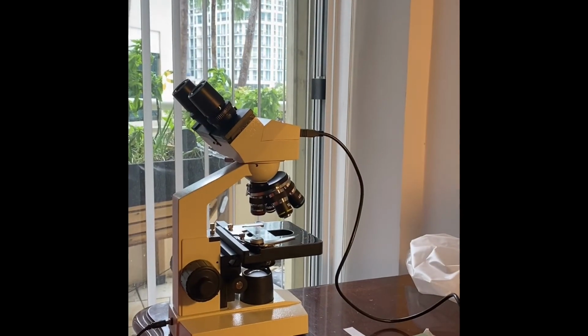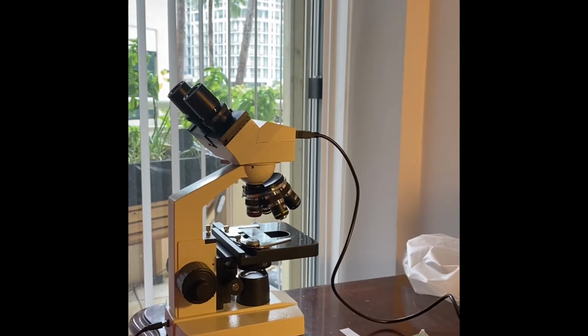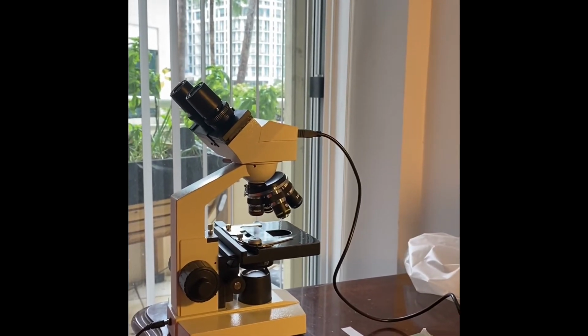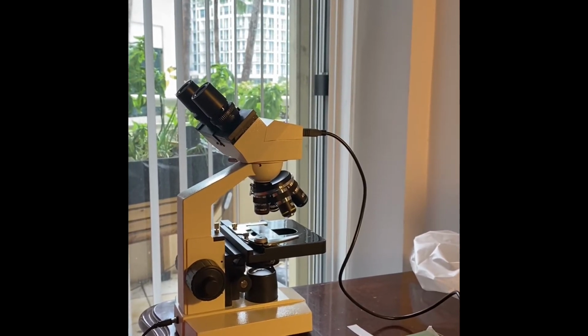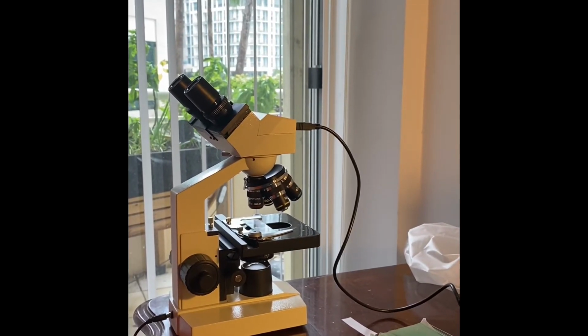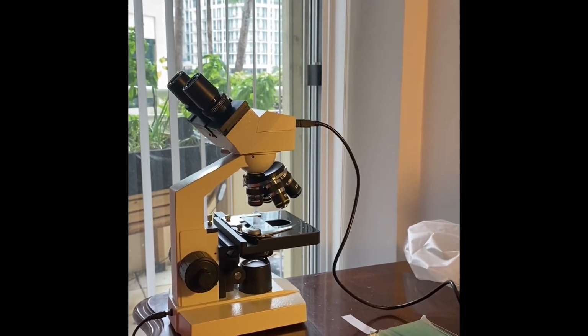Okay, we are all ready to record all our observations in our laboratory notebook. This is laboratory number 3, session 3. There's an introduction, followed by materials, followed by instructions on how to make the slide.